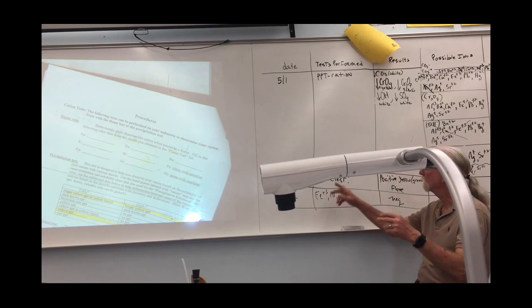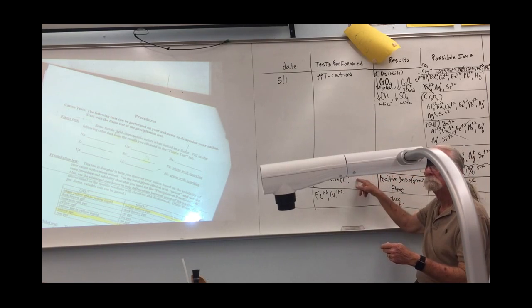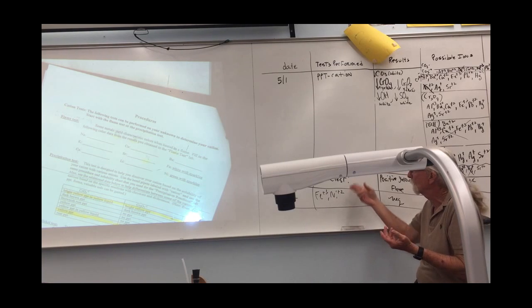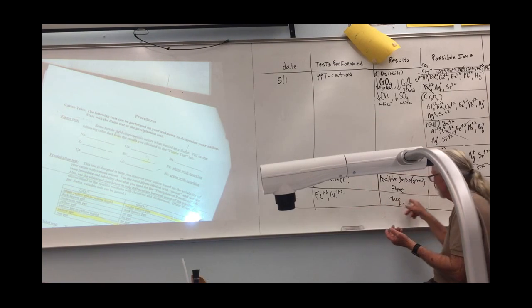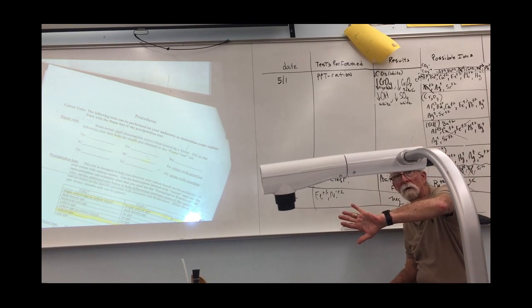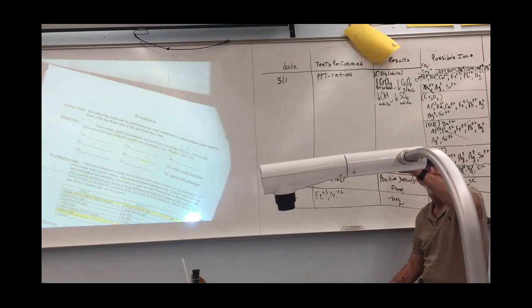Now, that's only 2 tests. Just for the sake of doing a test, you do an iron nickel test to make sure it wasn't one of those. It's negative. There are your 3 tests. You can write on the back of your card, those were your 3 tests and why you think your unknown is barium, and you put BA underneath the cation for trial 1.